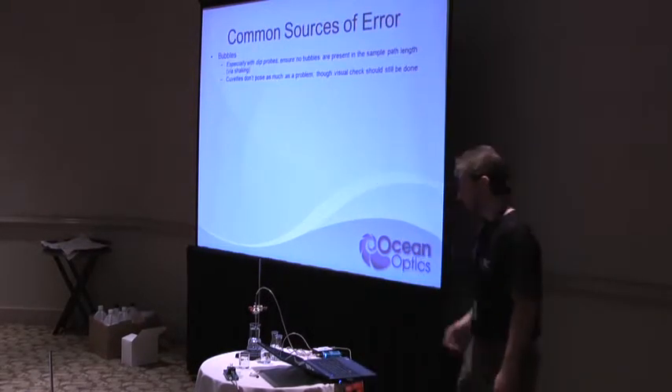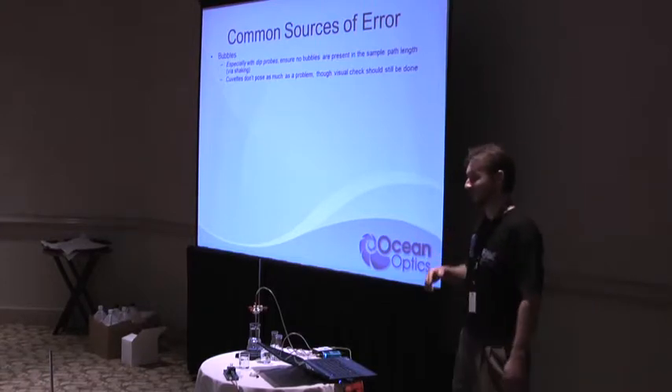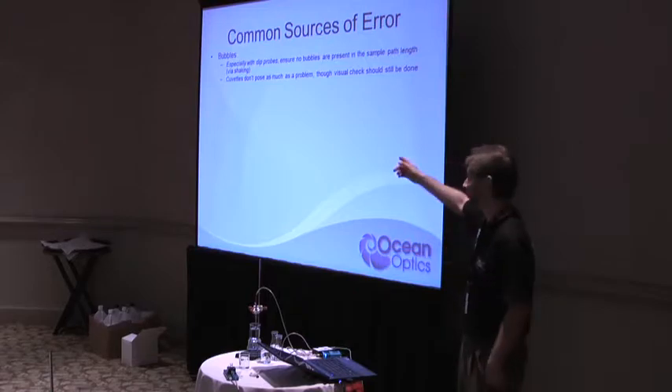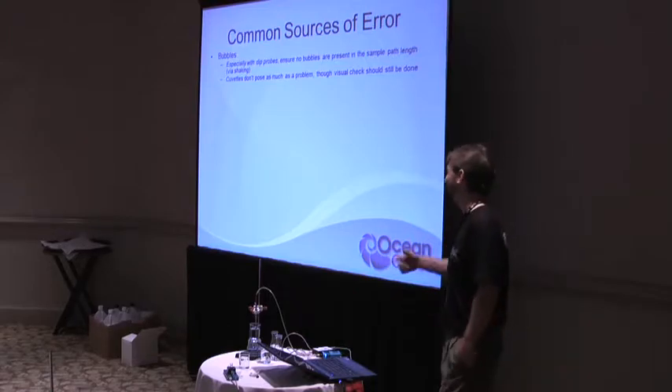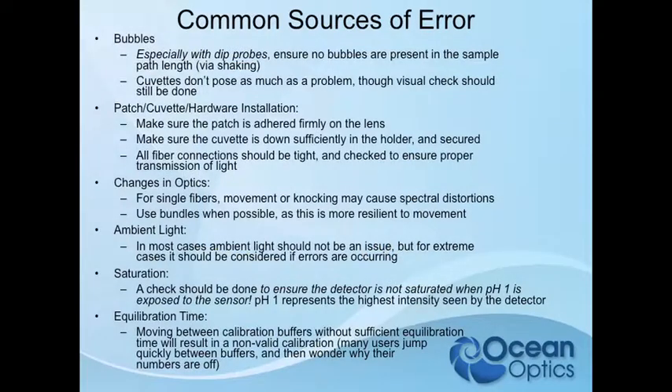Common sources of error — some of the other groups earlier had this same first issue and had to redo all their work. Bubbles are pretty notorious in the dip probes. You're going to have to do a visual check to make sure you don't have bubbles in there, because that's going to definitely change that path length.